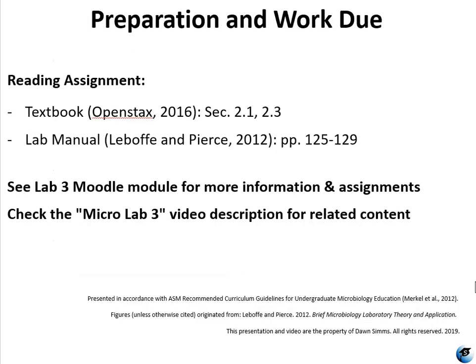So I hope you really have fun with Lab 3. The Foldscopes to me are very interesting, and they're not as good as the scopes we use in lab, obviously, but we're going to be looking at things that are on a larger scale as much as possible. When we get to some of the smaller things in labs 4 and 5, you're going to see even more online simulations. But for Lab 3, you should be able to see all of these specimen. You should be able to focus them. Spend some time working with your Foldscope, get used to manipulating the slides and things like that, and have fun with it.